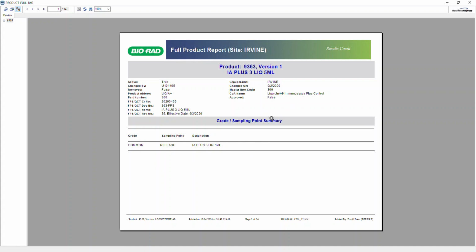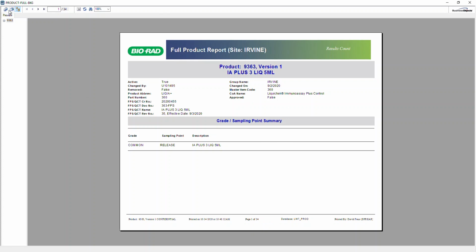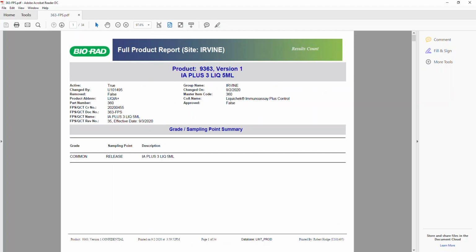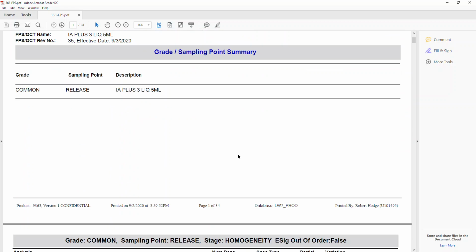the SAP name. I'm going to jump to, and the best way to review this is to print this to PDF so you can scroll through it a little easier. So what I'm going to do is jump to a PDF of this version. We have a PDF version of this, and I'm going to blow this up so we can scroll without jumping page to page.